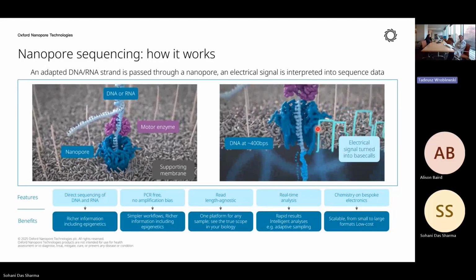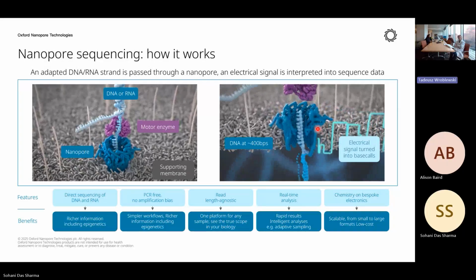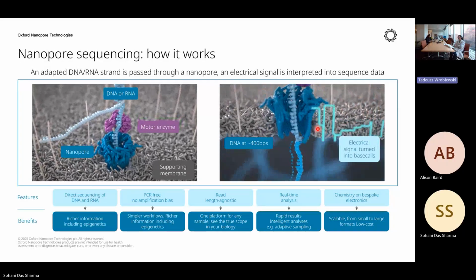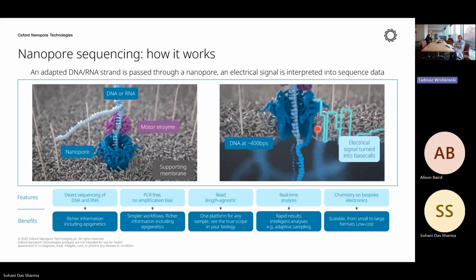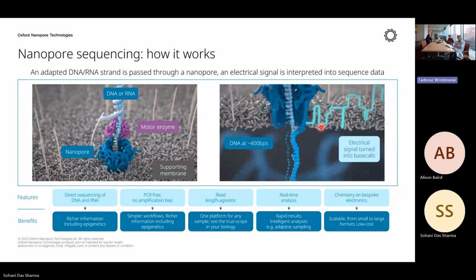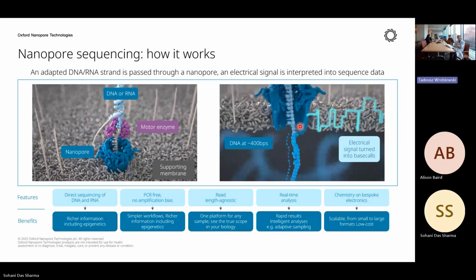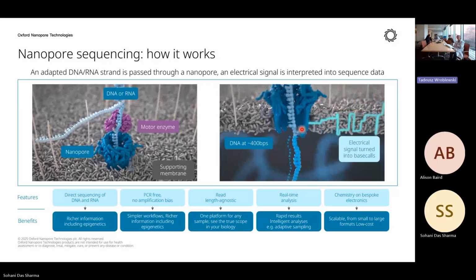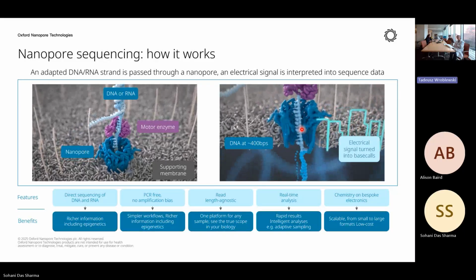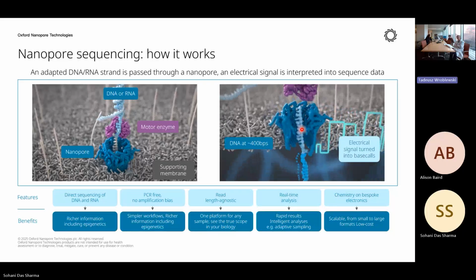Using our software, which is trained using different models, a machine learning or neural network based software, we can deconvolute this signal and get the information of all the bases at single nucleotide resolution. Does a specific base have a specific signal? Yeah.